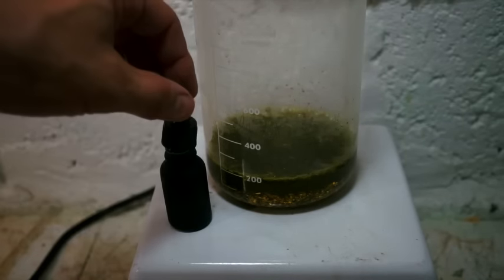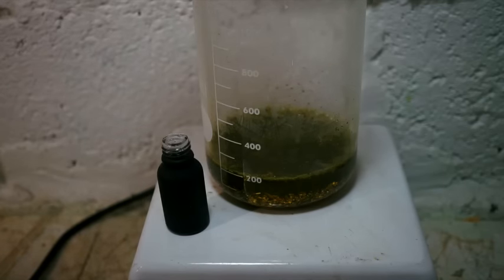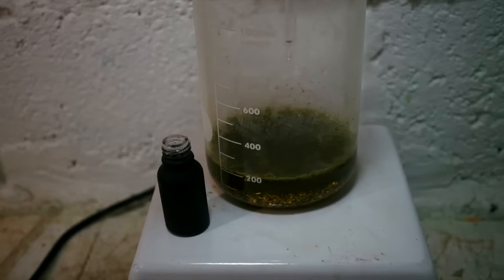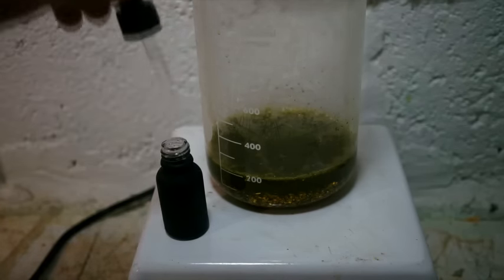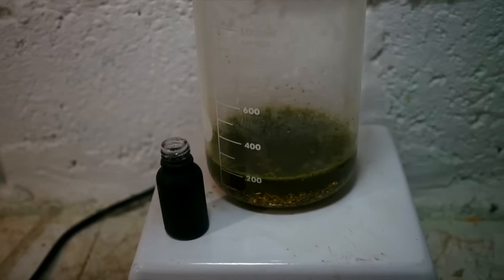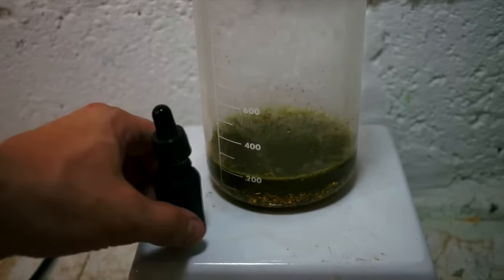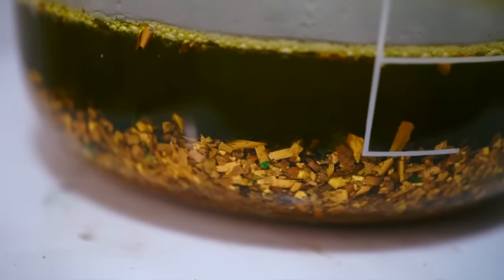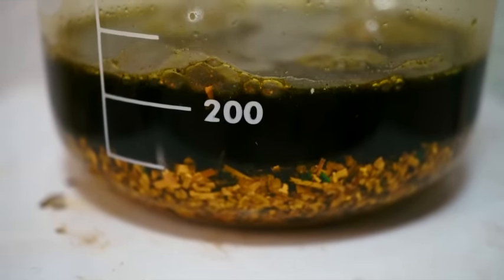We will now add a small amount of nitric acid. I like to use the method of incremental dosing so that we won't have an excess of nitric acid. Gently warming the mixture will aid in the reaction.